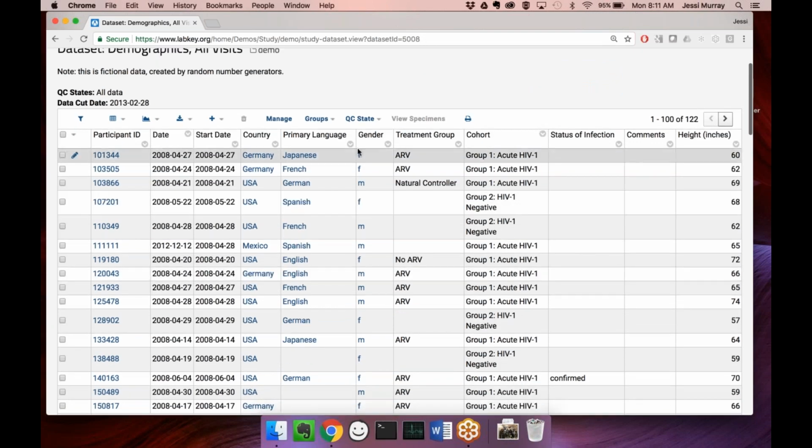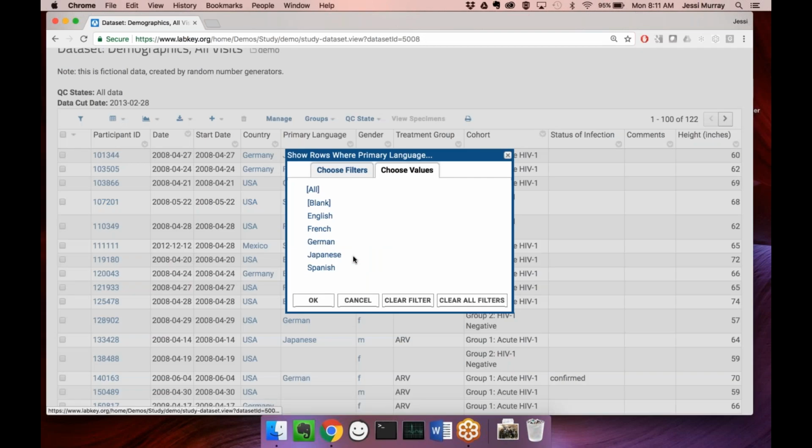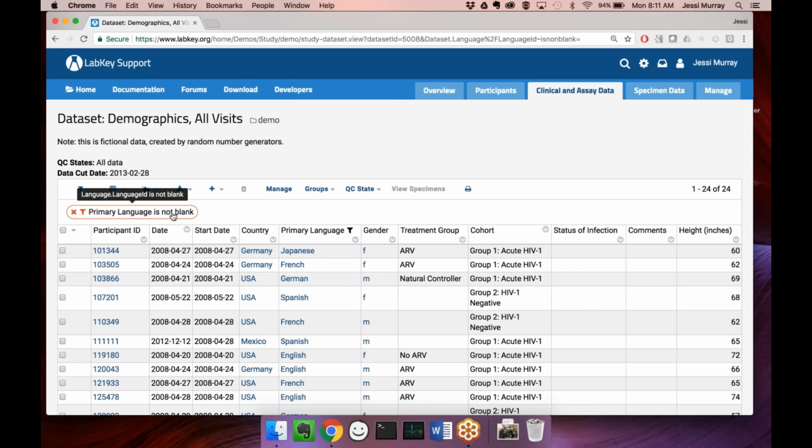And then some things that we did here was we updated how the filter bar actually looks. So if I set filters, they appear in these little bubbles here. These are actually, there's a bug that has not been deployed to this site yet.